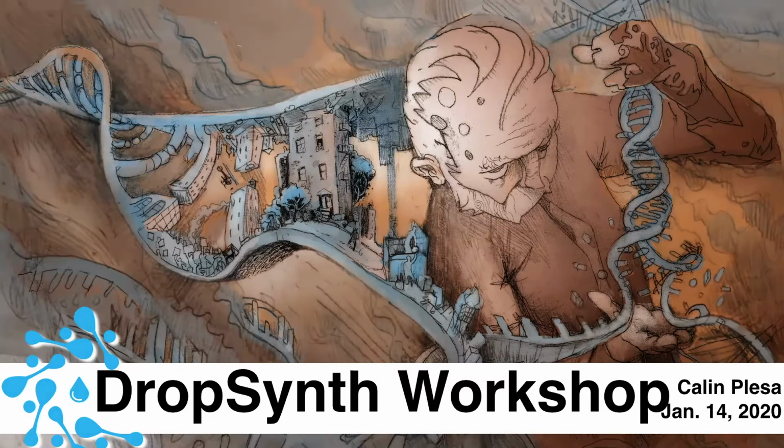So as you heard yesterday, I developed this technique called DropSynth, which allows us to assemble very large libraries of very diverse sequences. And this particular approach excels if you have a limited subset of sequences that you want to explore. And so any kind of questions where you've built models, or you have very well-defined hypotheses where you want to explore very well-defined regions, this is something that you can look at.